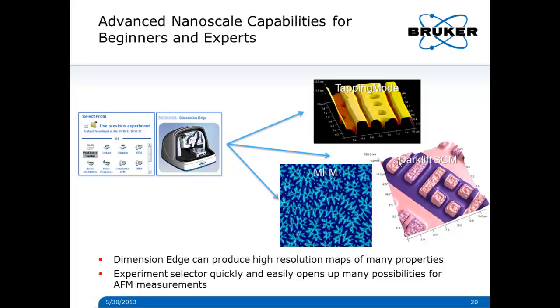You can get a dopant profile map. So this is a SRAM, and we have the laser turned off during the scanning capacitance measurement, so we can actually avoid having any photocarriers being excited. But the map there is of the dopant profile without photocarriers.